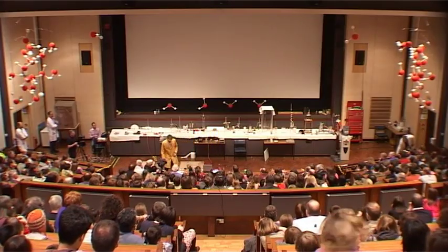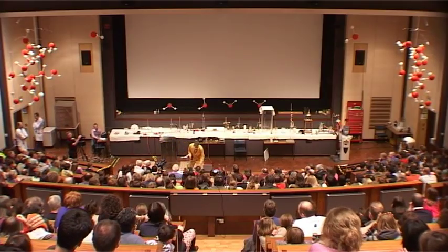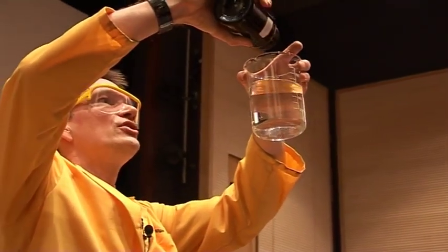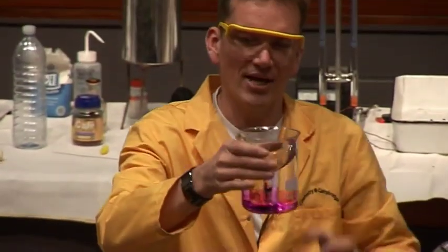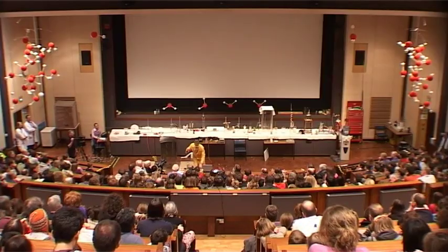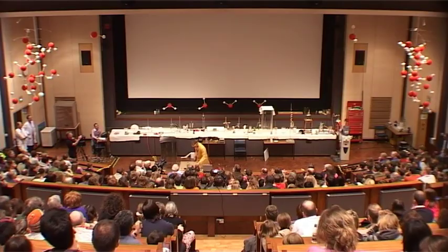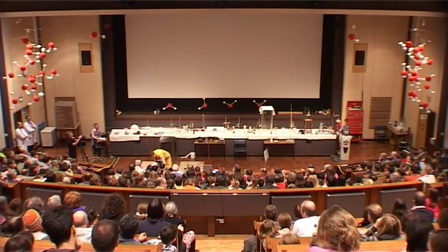We'll look at one of the other properties of water now, and that's that, of course, things dissolve in water. I have some crystals here of potassium permanganate, and I'm using these because they're very brightly coloured. Adding these to water, they dissolve very easily, and we get this intense purple colour. So some things dissolve very easily in water. Another thing that dissolves is this crystal that I have down here.